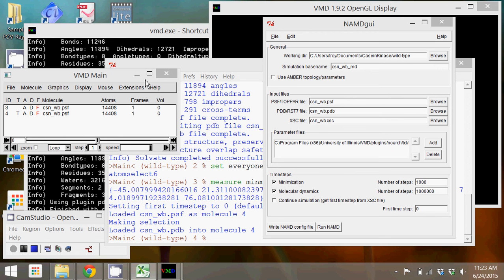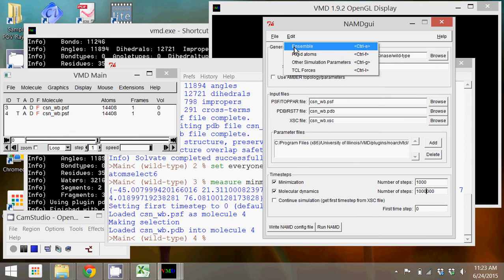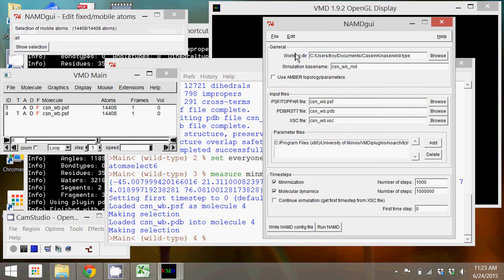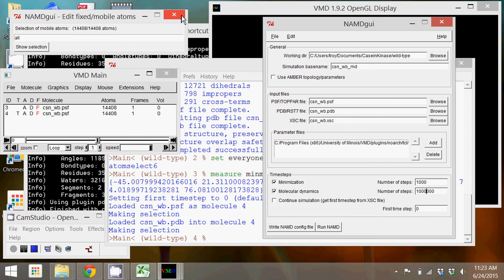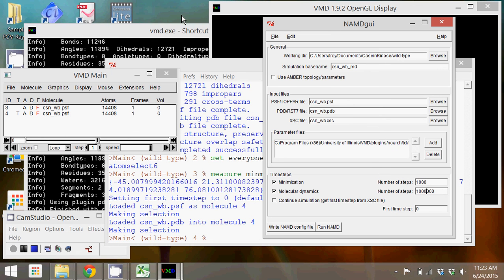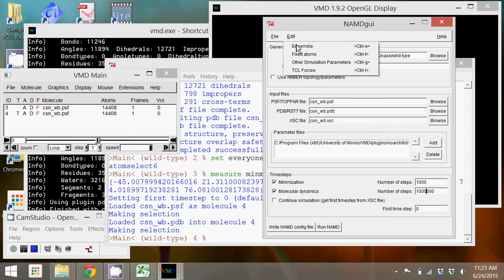I mentioned that you could fix atoms for a minimization. If you were to click fixed atoms, you could change the selection here. You could put water, for example, or you could put protein, and then you could run a minimization on just the unfixed parts of the structure that you have.